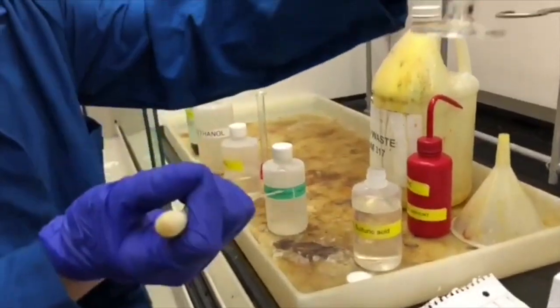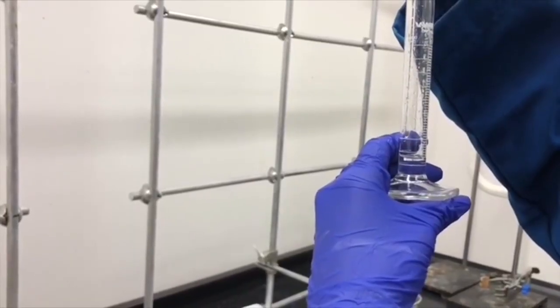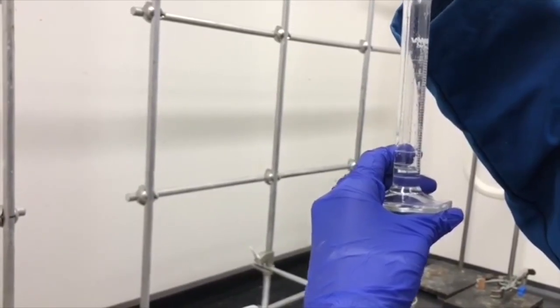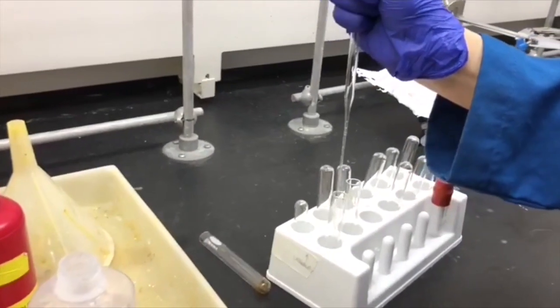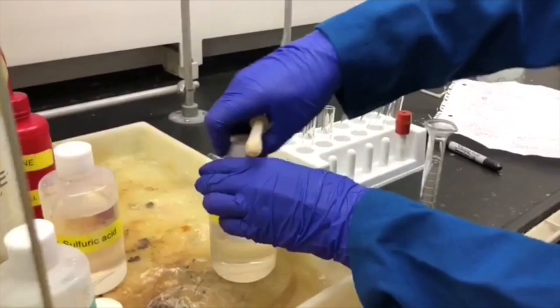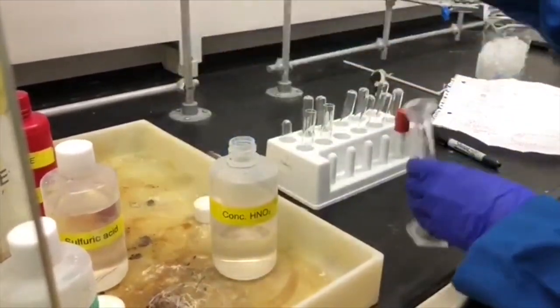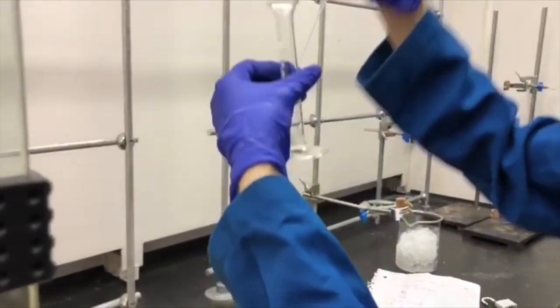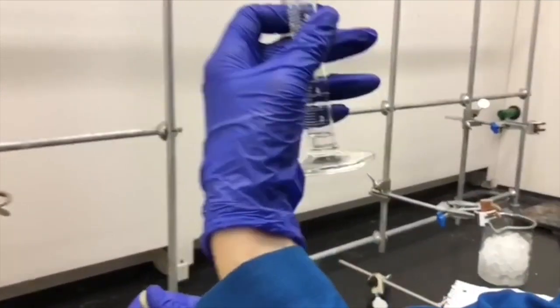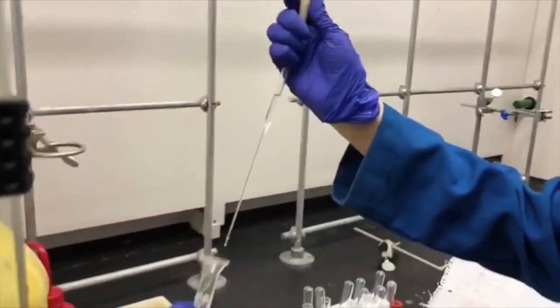First thing we're doing is measuring out 0.5 mL of nitric acid. So that's what I'm doing right here, and we're going to pipette it into a test tube. Then we're going to pipette out 0.6 mL of sulfuric acid. So I'm measuring that, and we're going to pipette it into a test tube as well.